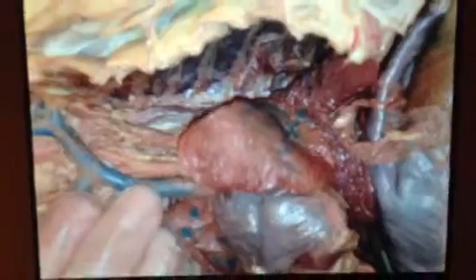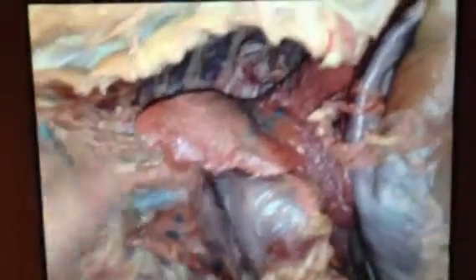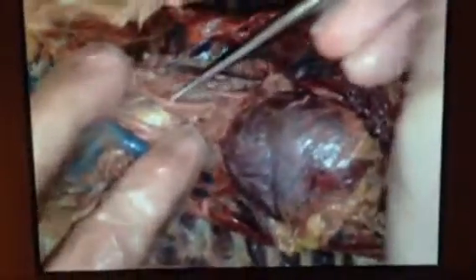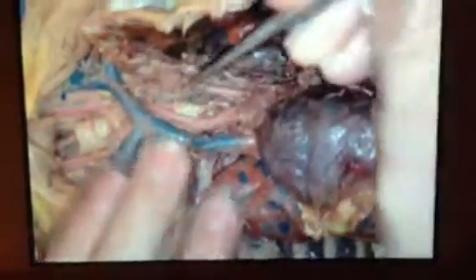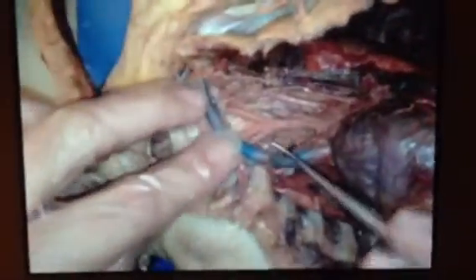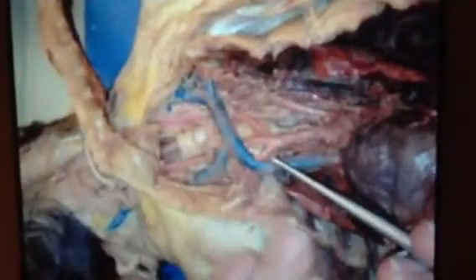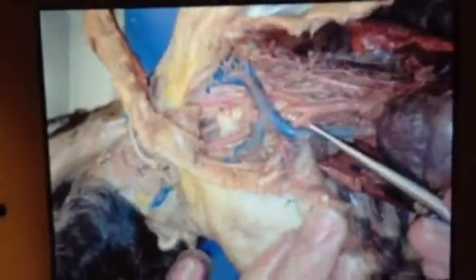So, brachiocephalic artery, like I said, and then this is going to branch. This first branch, left subclavian. Then we have left common carotid, which goes all the way up to the brain or skull. And then we have our right common carotid. And then over here, the last branch right here is the right subclavian artery. Okay.